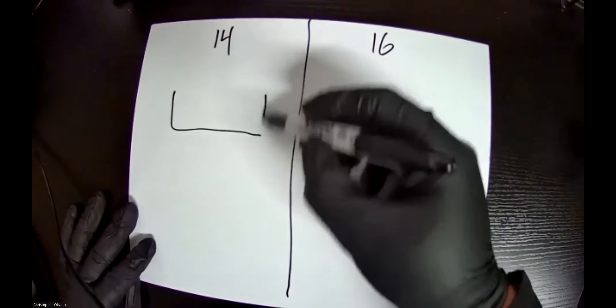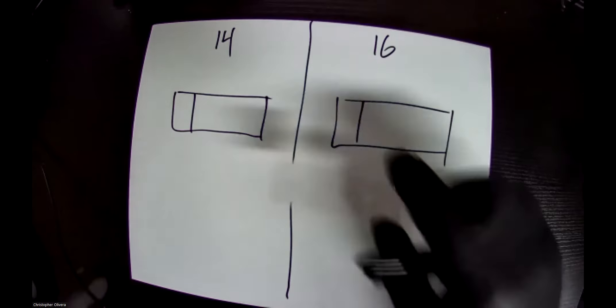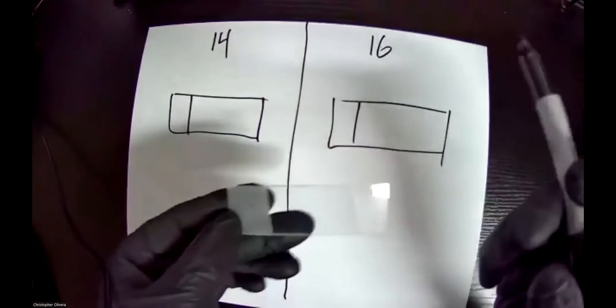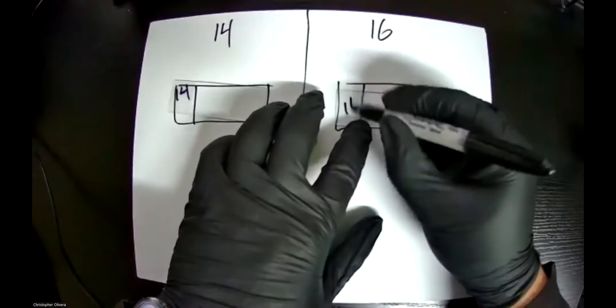I usually use a piece of paper — anything will honestly do. I like to mark where my slide goes to help me find locations, and I even mark where the frosted version of the glass is. I already have my slides clean so I don't have to worry about them too much. Here's the lab 14 slide — I'll mark it — and here's the lab 16 one, so I'll just write '16' over there.